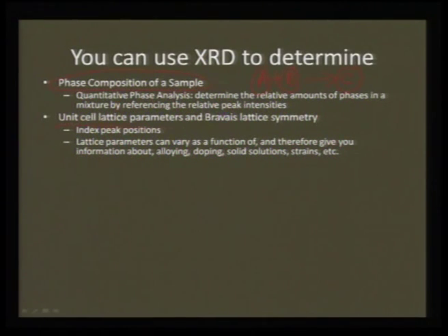And then more importantly, when we want to analyze and understand what sort of crystal pattern comes when two samples are heated together, what is the nature of crystal symmetry of the third pattern, that is the product, then you talk in terms of unit cell parameters and what is the lattice symmetry. We can quantify all this in the indexing of the peak position lattice, and we can also look at the lattice parameters that can vary as a function of the substituent ions composition.